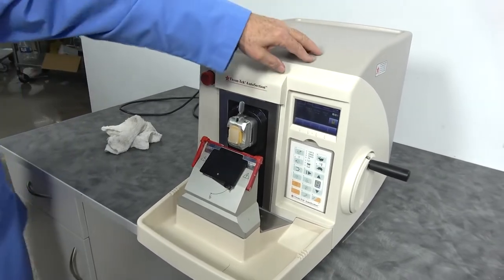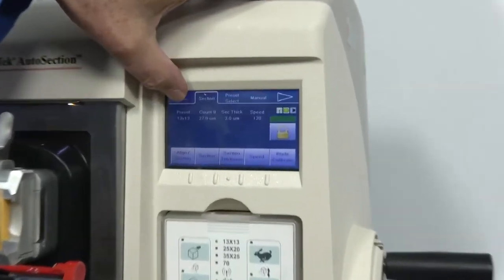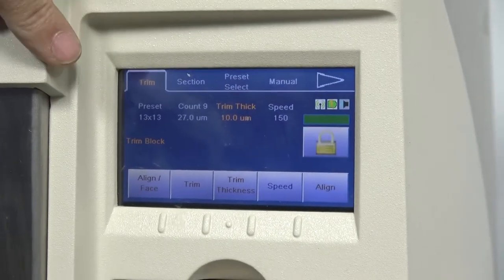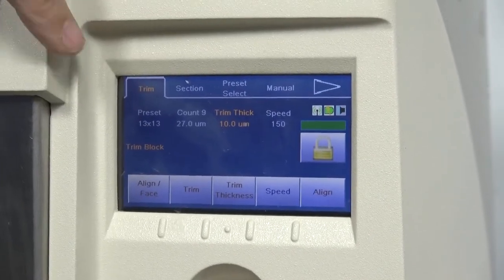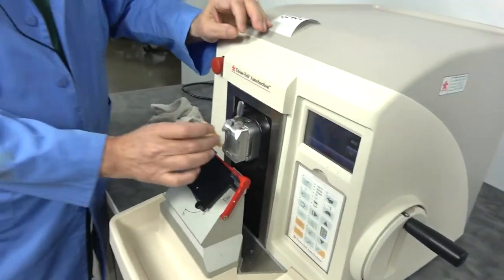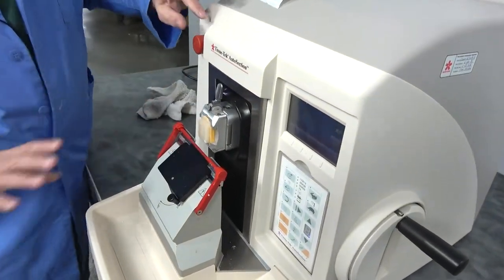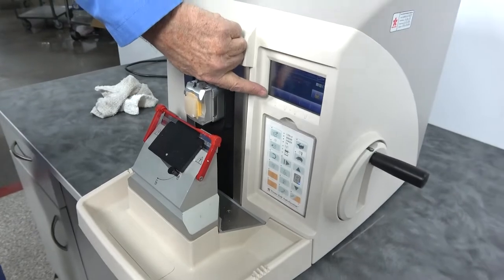Very simple to use machine on the basics. We're going to talk about it now. We're going to start as if we trim the unit. We're going to tell it we want to auto-align. Like I said, I can go from a fresh mounting of a sample, freshly mounted, push the button.